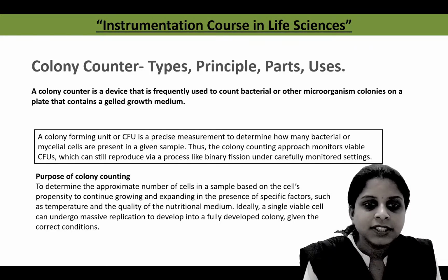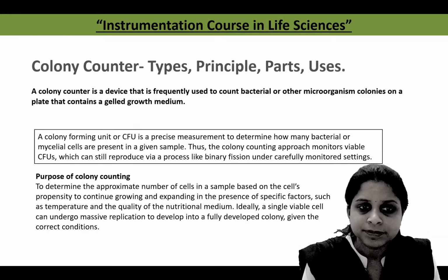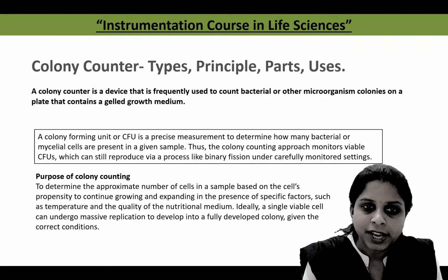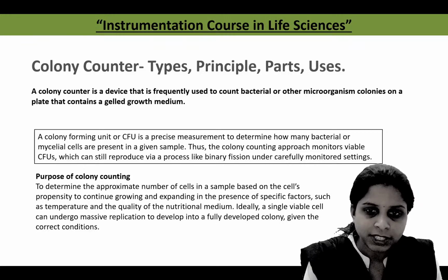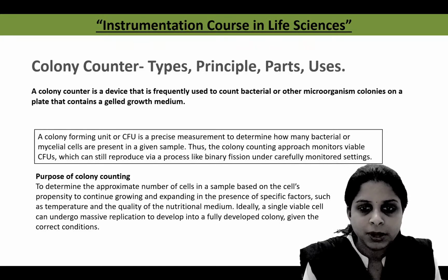Next is the purpose of colony counting, or why colony counting is important. To determine the approximate number of cells in different samples, colony counting is used. When we culture a microorganism at a specific temperature or with different quantities of nutritional medium, how many cells can be grown can be determined with the help of a colony counter.